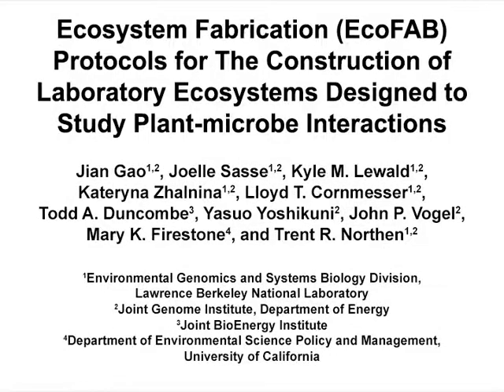The overall goal of this protocol is to define standardized approaches for the construction of simplified model plant ecosystems, called EcoFABs, that enable controlled, replicated laboratory experiments to investigate plant-microbe interactions that can be further tested in the field.